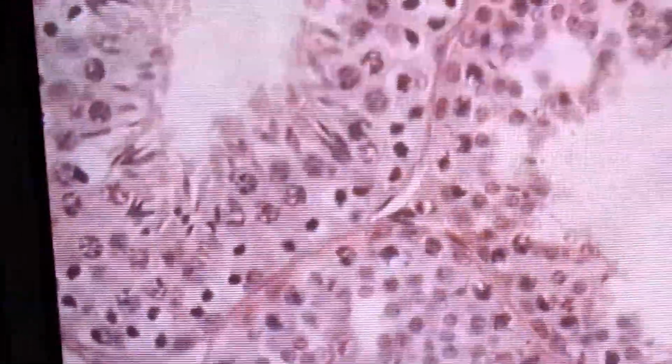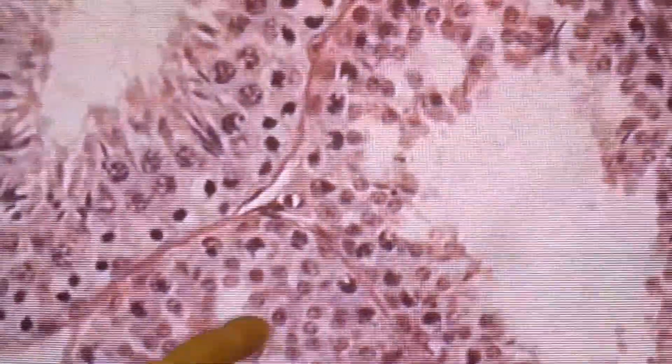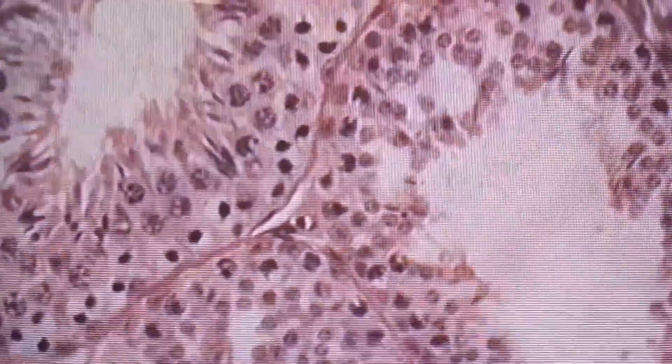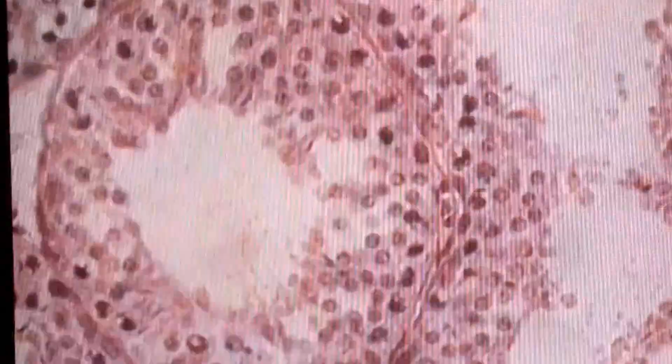Where are those polar bodies? No, there aren't any. Spermatids are deep there. They're all maybe just residual bodies because they've all hatched. Where are the residual bodies? These things. They have no nuclei, that's what's left. It's sort of like the eggs that the sperm have hatched out of.